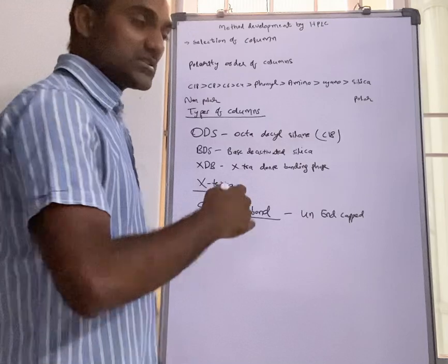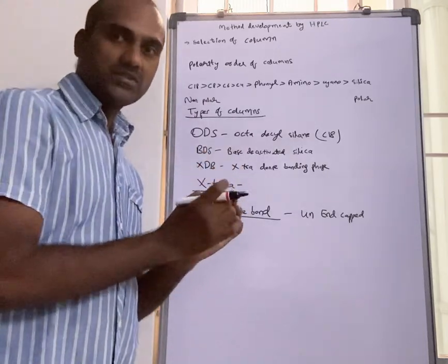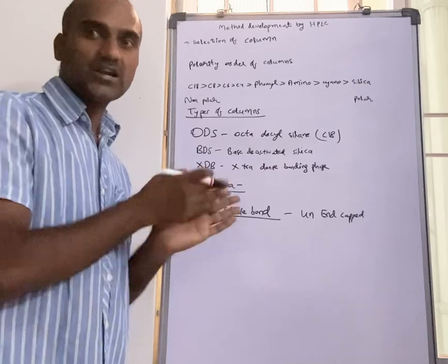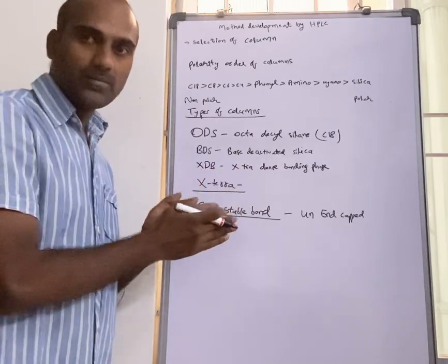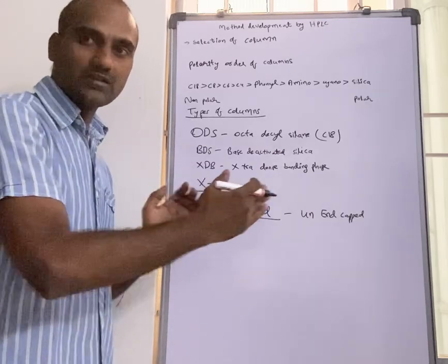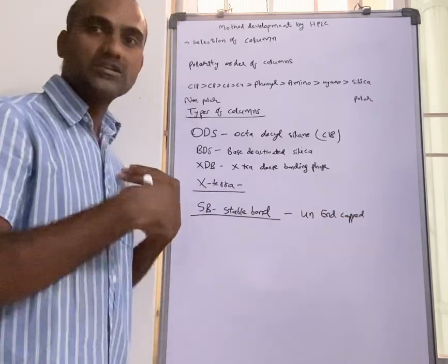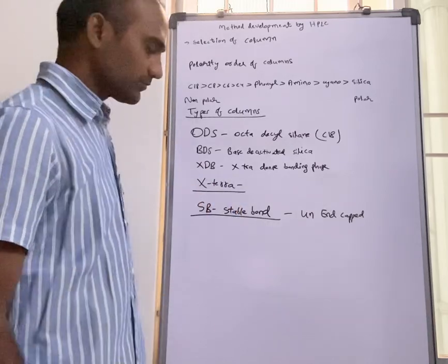How? Non-end capping means free silanol groups will combine with some analytes and will not combine with some analytes. So it will give you selectivity for the analytes, so separation will be there. Some analytes will be held by the free silanol group, some will be released, so there will be resolution. So based on the non-end capping, there will be a specific selectivity for the analytes. So that is also sometimes useful.